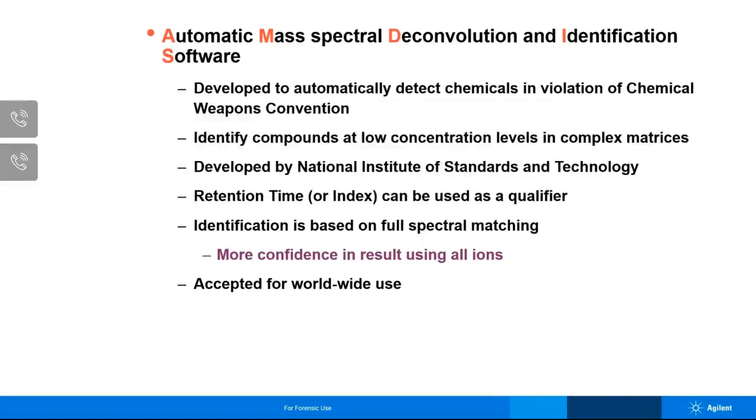And again, this was initially developed for chemical weapons analysis, looking for co-eluting peaks and low-level responses of different byproducts and parent products in the chemical weapons arena, and has been applicable to other areas, including forensics, utilizing retention time, deconvoluted spectra, cleaned up spectra where background has been removed to get a more clarifying spectral match and response, and has pretty much been used all over the world.